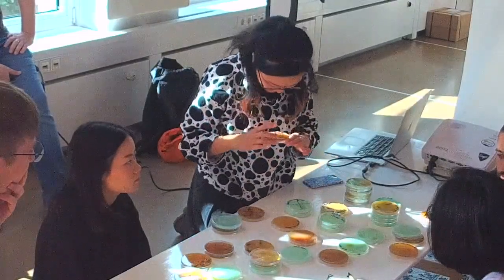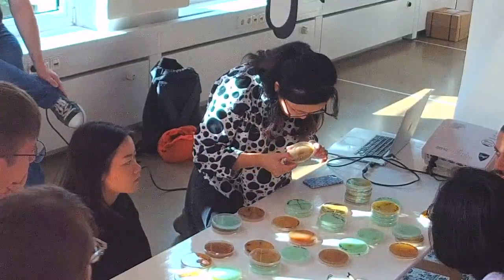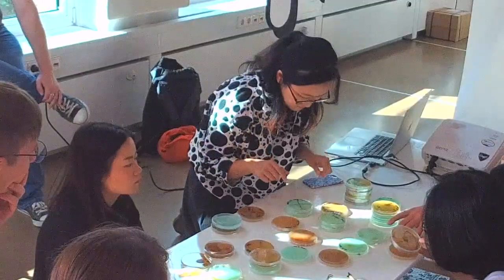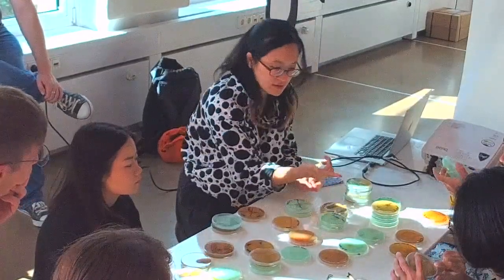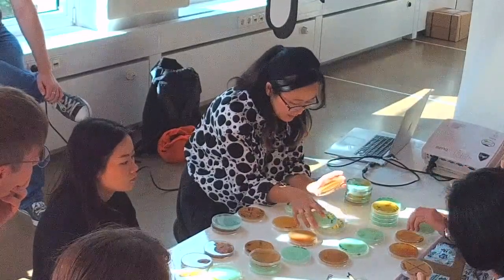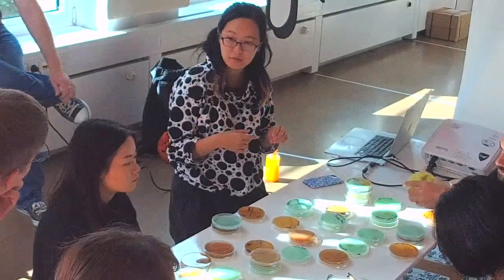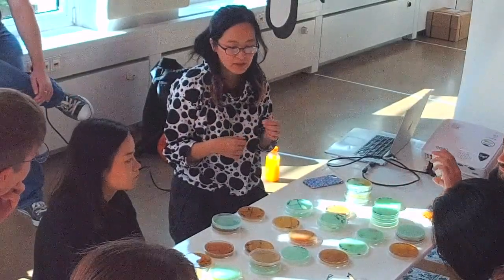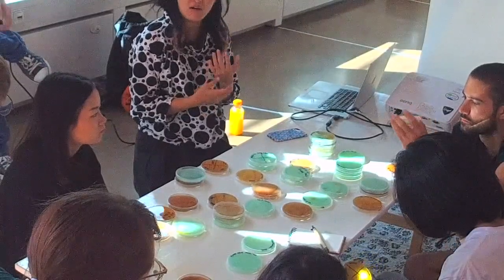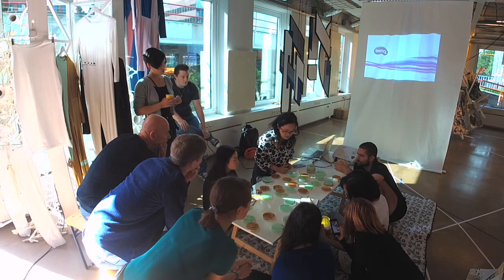Okay, that's another fuzzy one. The fuzzy ones are also much easier to see than single colonies. And I'm suspecting that if you wait for a while, after 3-4 days, you can see different colored ones coming out. Some of them grow really slowly, and usually the white one somehow appears first. But I see something.